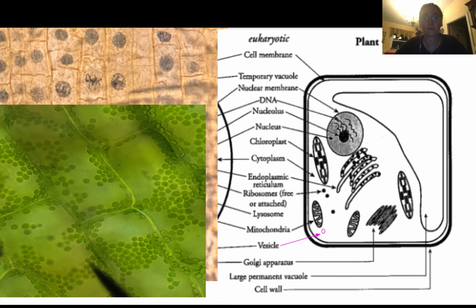We're going to look at this list of cell structures and see what we can observe from our microscopic images and what we already know about them molecularly. So first stop is cell membrane. It's kind of hard to know if we're seeing the cell membrane or not at this level, because primarily what we're seeing dividing up these cells, in the onion skin photographs and in the onion root tip photographs, is primarily the cell wall. So what we're seeing is the cell wall.